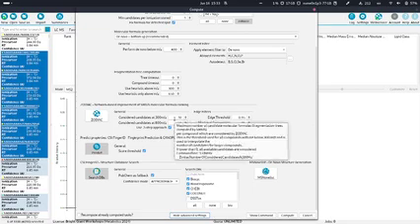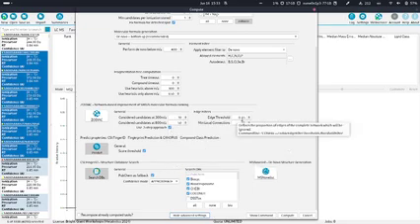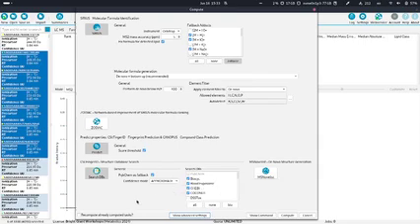Also, we now see that we have more options for ZODIAC, but I will also not go into these options in detail. And you should never touch them anyway. There's a reason we hide them. These are the options which are correct for the evaluation of the paper, and I think you should never change them. So for most cases, really stick with the basic mode, which also has some settings. It's not that you should always use the default settings for everything, but you should at least not be required to change the advanced settings very often.